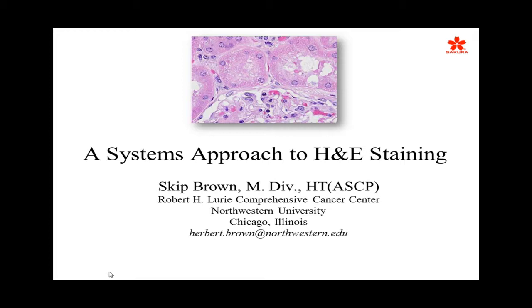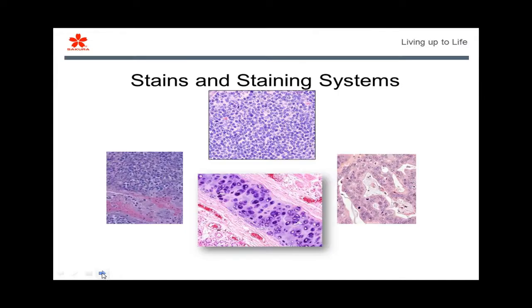Well, a staining system is designed to minimize, if not eliminate, those changes because the reagents being buffered and the dyes being buffered will not allow the pH to adjust itself or to change itself. What we're talking about is being able to maintain the same intensity that you started with during your run. You optimize your run based on the preference of your pathologist, whether he likes it darker or lighter, but you want to maintain that consistency in staining throughout your run.